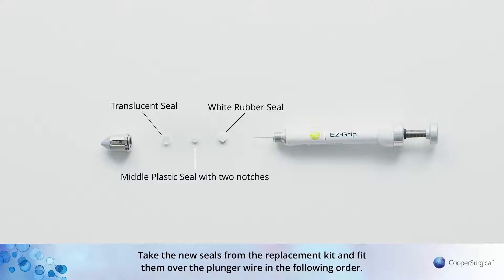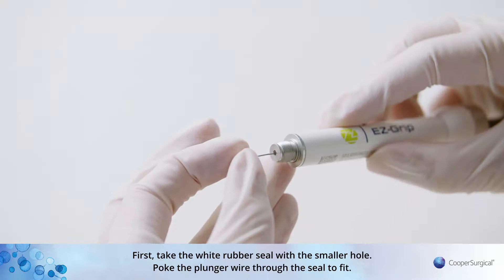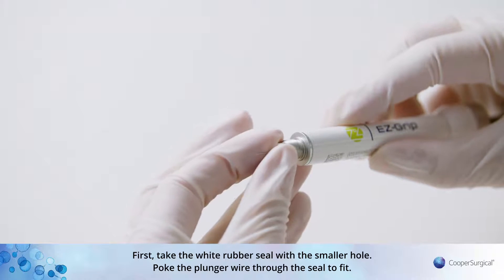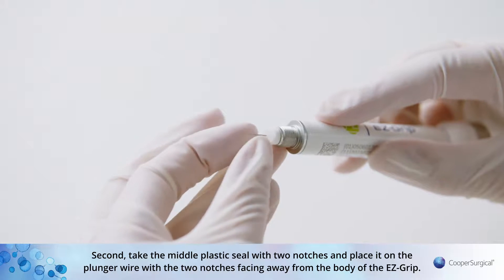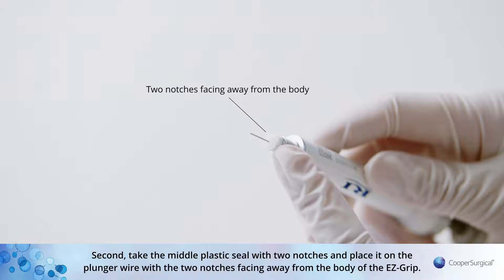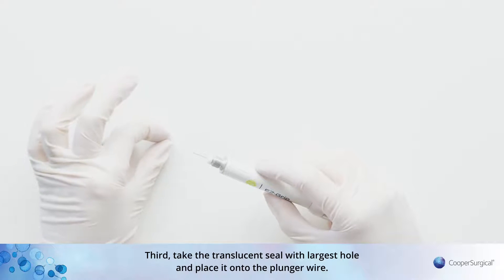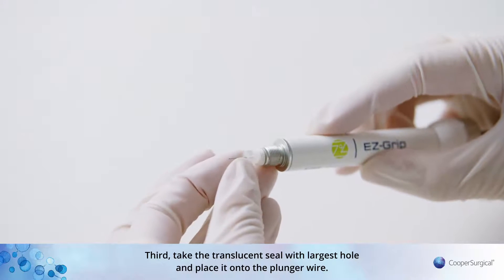Take the new seals from the replacement kit and fit them over the plunger wire in the following order. First, take the white rubber seal with the smaller hole and poke the plunger wire through the seal to fit. Second, take the middle plastic seal with two notches and place it on the plunger wire with the two notches facing away from the body of the EZ-Grip. Third, take the translucent seal with the largest hole and place it onto the plunger wire.